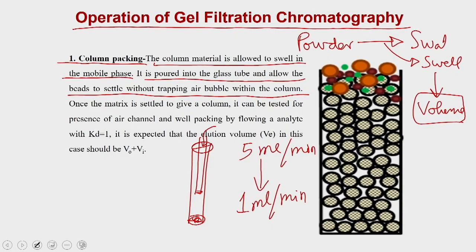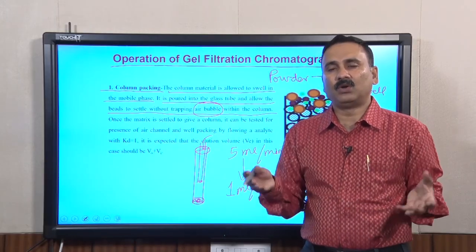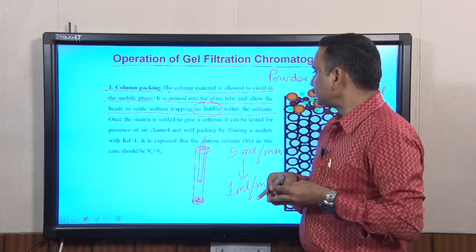The other thing is that you should always try to avoid any air bubble or any kind of air within the column, and that is very important for gel filtration chromatography. That is very important if you would like to resolve the molecules on a gel filtration chromatography column.